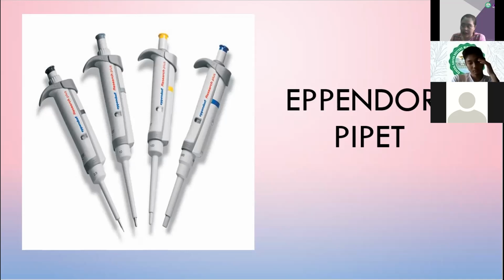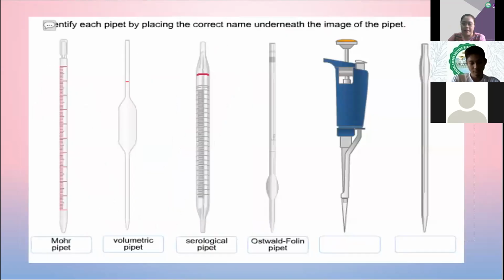So this is very useful in the laboratory, especially during laboratory testings. We don't actually use that much of the chemical substances or even the blood or yung pagpapainom ng gamot like sa mga animals natin sa laboratory. Hindi talaga siya necessary na masyadong marami. Most of the time, microliter lang. Kaya pinaka-ginagamit talaga si Eppendorf or si micro pipette.